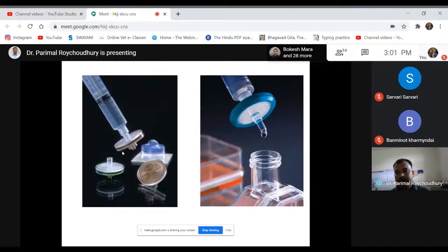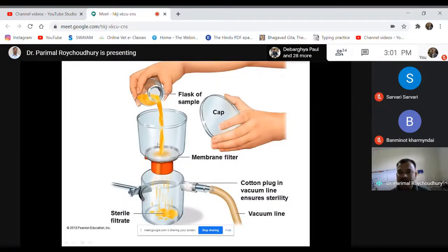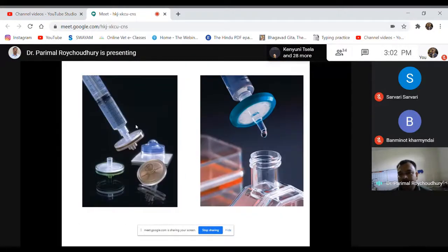Now this membrane filter assembly is suited for higher volumes, say 100, 200, 500 ml, 1 liter of chemicals or media that we can sterilize by this membrane filter assembly. If your amount of media is very small, say 1 ml, 2 ml, then this kind of bigger apparatus is not suitable. So for that, a special item has been designed. It's called the syringe filter. Nowadays we most commonly use syringe filters for filtration of low volumes of media and chemicals.